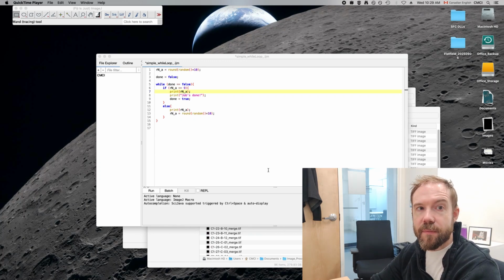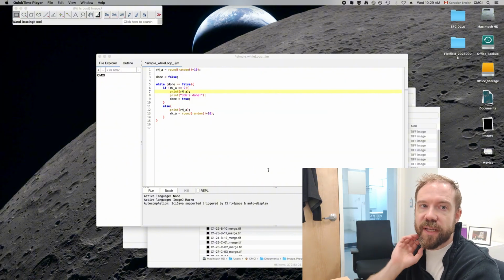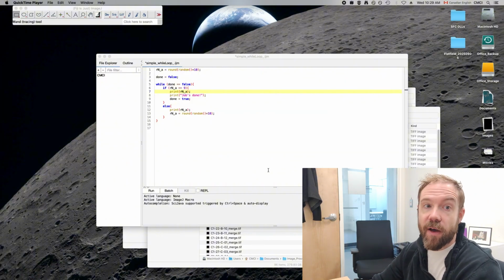Welcome back. In this video I'm going to talk about while loops and I'm going to talk about if conditions. So while loops I don't use very often. It's very easy to get them stuck in a recursive situation where they just run infinitely and never satisfy that off condition.